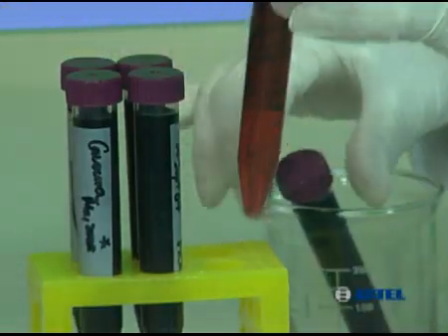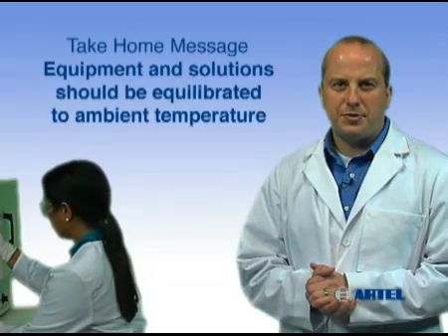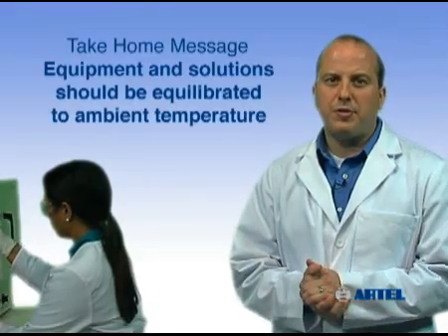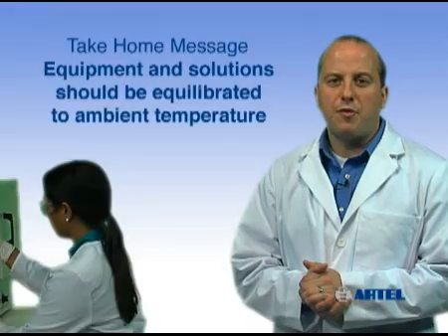The take-home message is: work at a uniform temperature to minimize variation in dispensed volume. Allow liquids and equipment to equilibrate to ambient temperature before you begin pipetting.